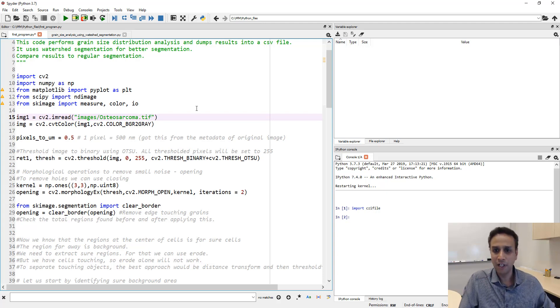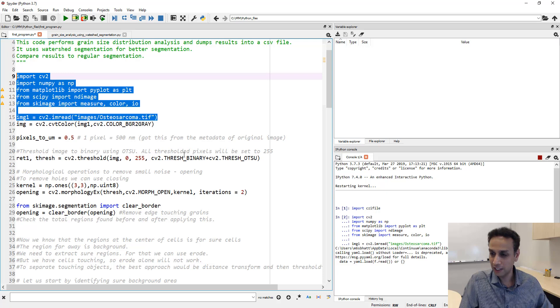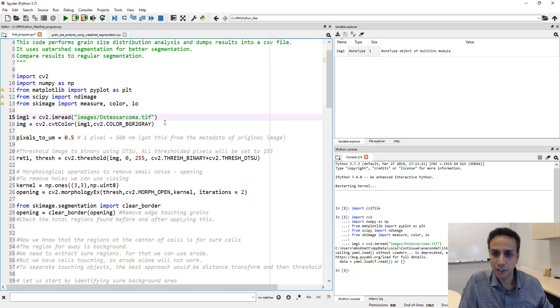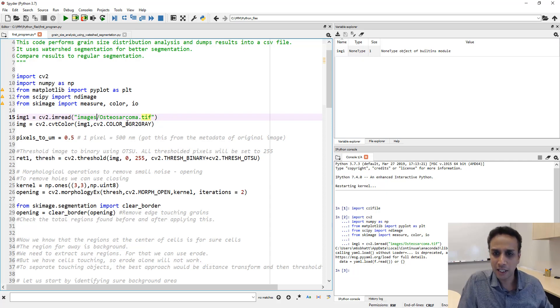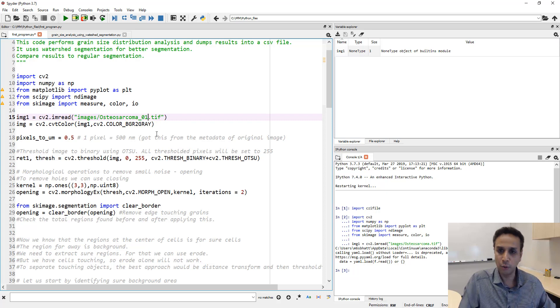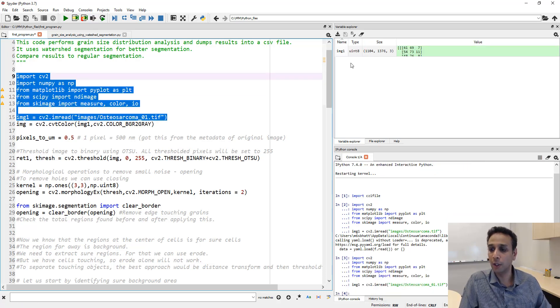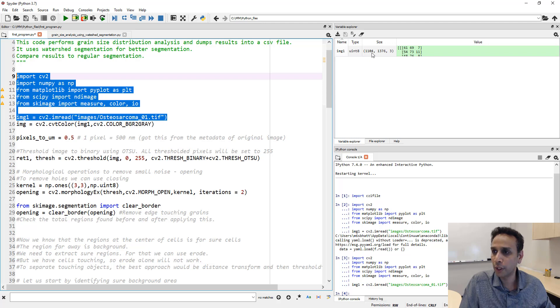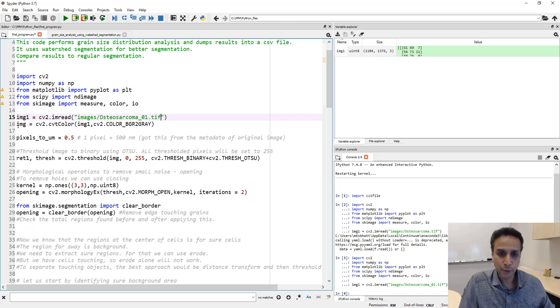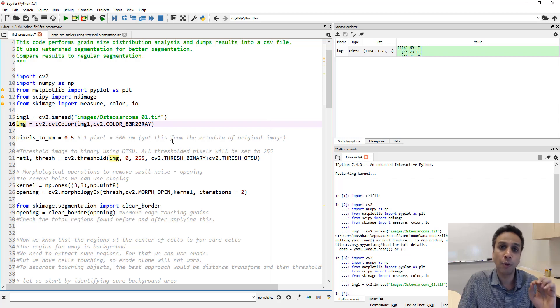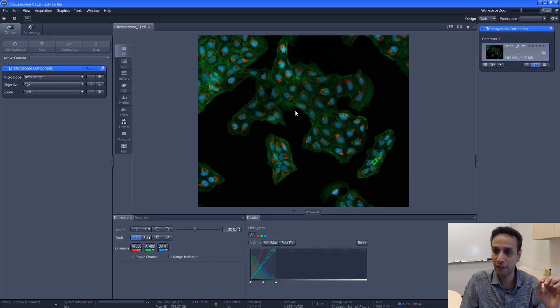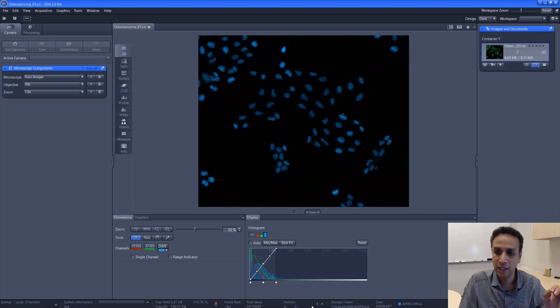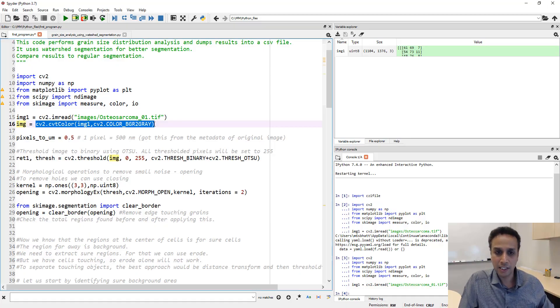Let me run the program until this point. I need to fix this, it should be osteosarcoma_01.tif. There you go, this is unsigned integer 8, 1.1k by almost 4k by three channels red, green, and blue. The last time we converted the image into a gray level image but I do not want to do that now because our information is contained very nicely in the blue channel. Let's separate the blue channel out.